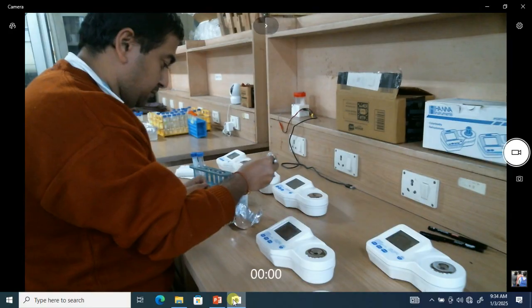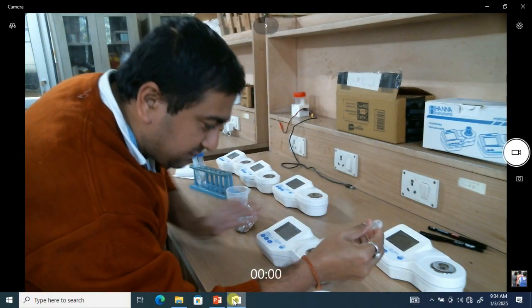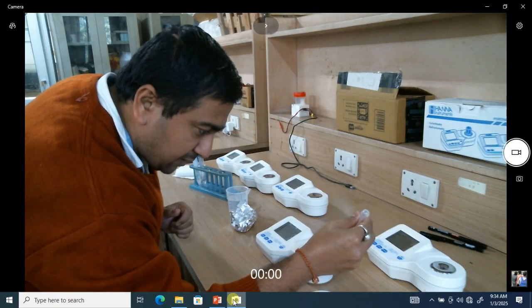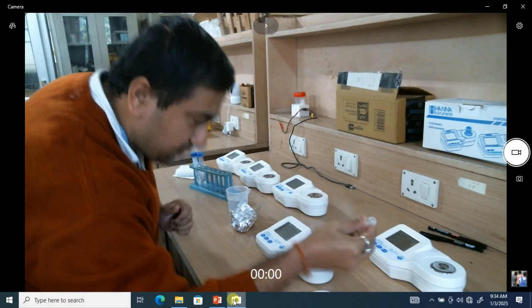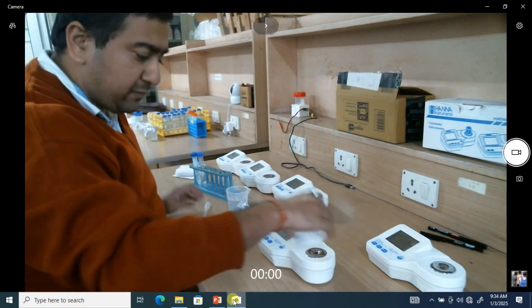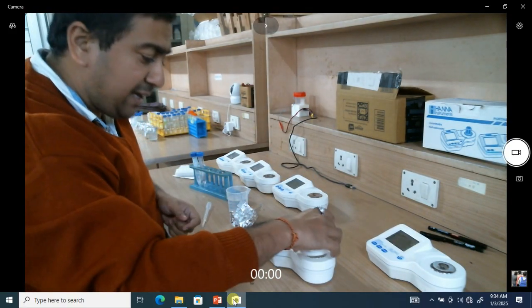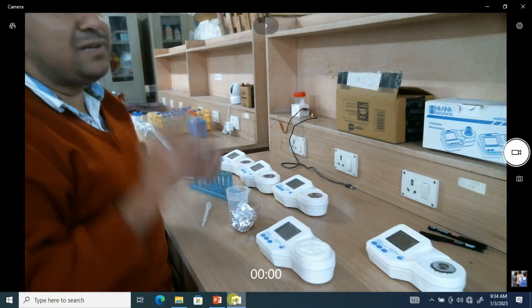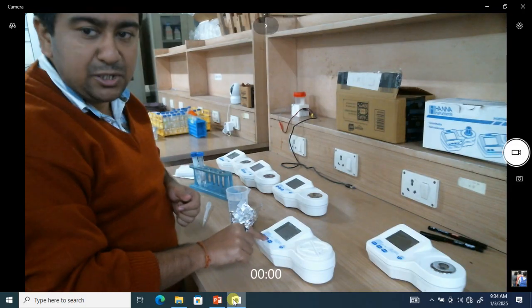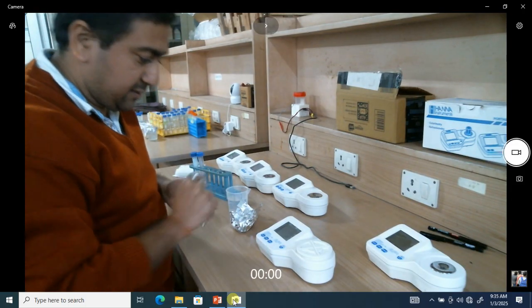We will place it exactly at the center of this prism. And then we will cover this with a cap that is placed at the back of the instrument. Why? In order to avoid any kind of interference of light. And then we'll go for 0. 0 means calibration. So the instrument gets calibrated.